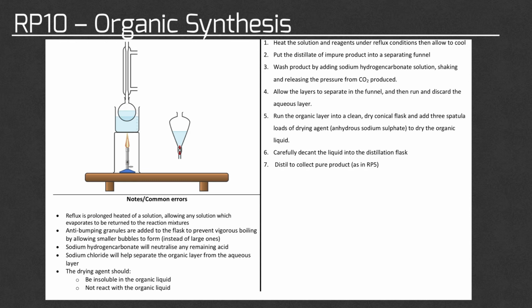The drying agent, to remove any of the water left in the sample, needs to be insoluble in the organic liquid and not react with the organic liquid, as we don't want any side reactions taking place.